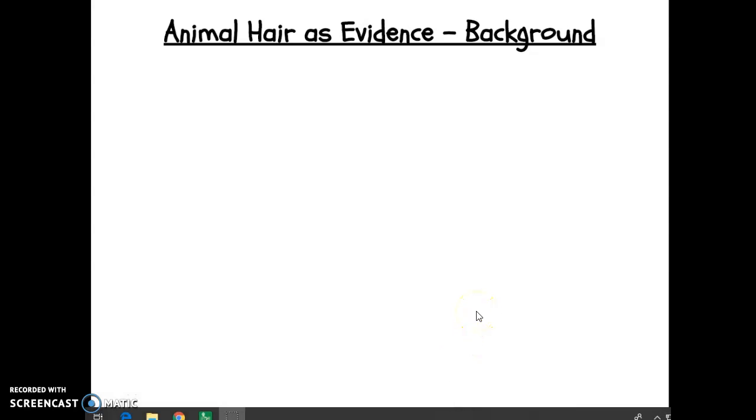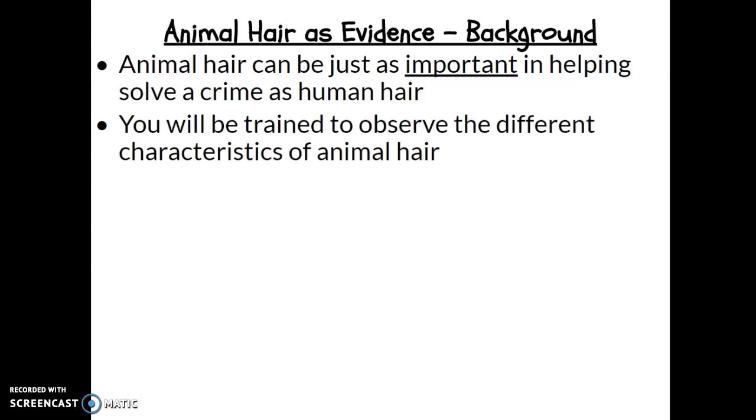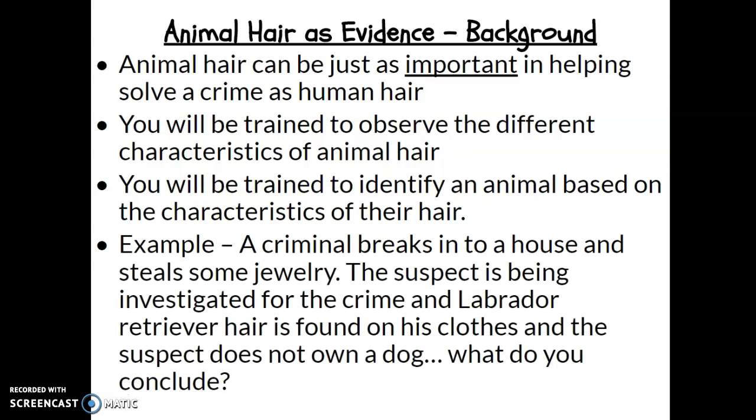Okay, now we're going to start looking at animal hair as evidence. Now that you've seen human hair, we can start looking at animal hair. There are some differences, and this can be just as important as human hair. You're going to be trained to observe all the different characteristics, and it's important because think of this.